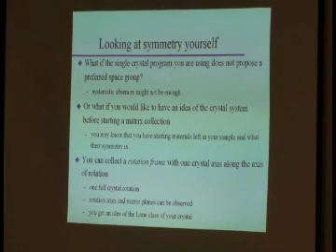Now, why do you go through this class if the computer does most of the work for you? Well, sometimes the computer fails, okay? That is when it's important to know something. For example, your single crystal program might have managed to index, but it doesn't propose a space group to you. Dang. What now? Systematic absences might not be enough, or it may just not have enough reflections to be confident about making a choice, okay?